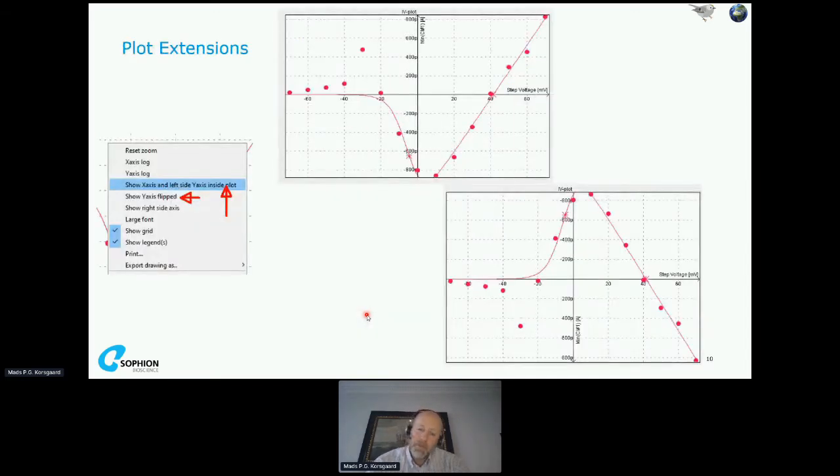Furthermore, maybe you noticed already on the previous slide, that we can now make these the way they should look, where the crossing is in 0. So the way it should look when you want to present your results from your experiments. You can even flip the graph. I don't remember exactly why this was asked for, but somebody asked for it, and we made it.